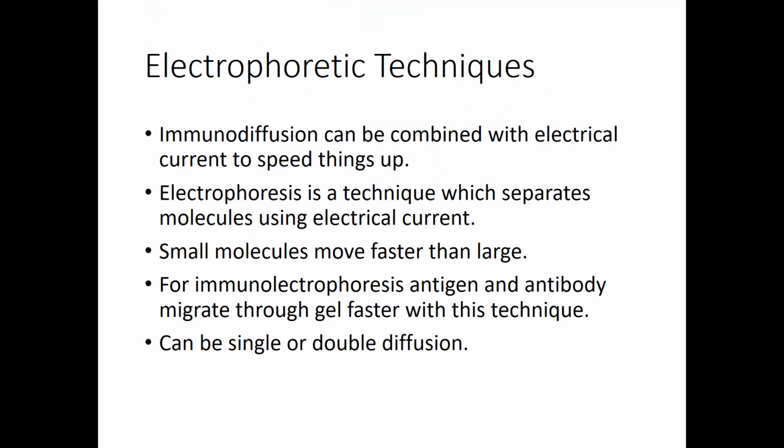Electrophoresis is the next technique we're going to look at. This is also a process where we're going to use a couple of different methods with electrophoresis.